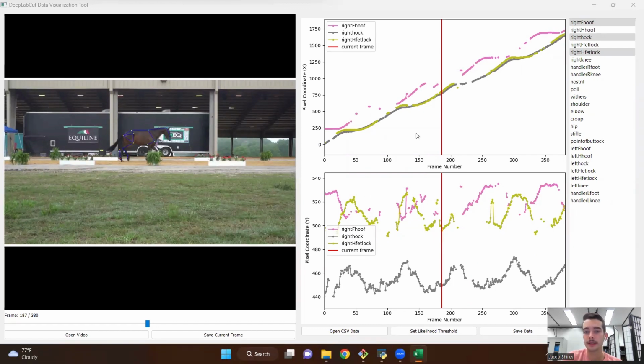One important thing to note is that it's 2 separate files being loaded into the application at the same time. And so you need to make sure that they are, in fact, the matching video and spreadsheet from the same model output. Otherwise, it can display both of them, but it'll be weird and mismatched. So you need to make sure that the data you're inputting is correct before you do any analysis.